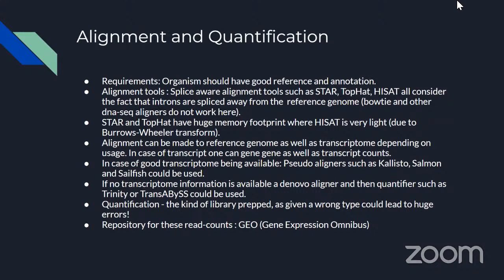The most used one right now is the STAR tool. So there's STAR and there is TopHat. But the main thing is that these tools have very large footprints.